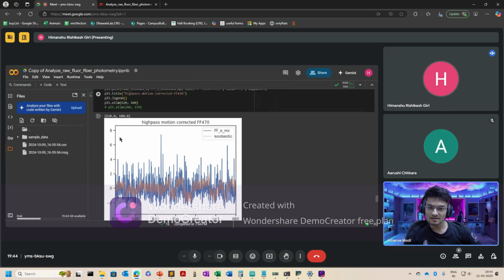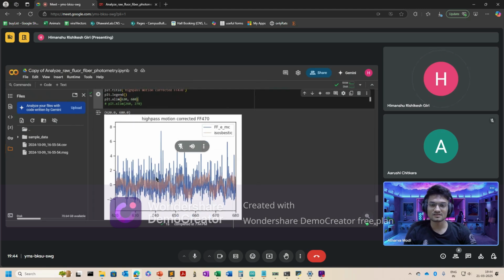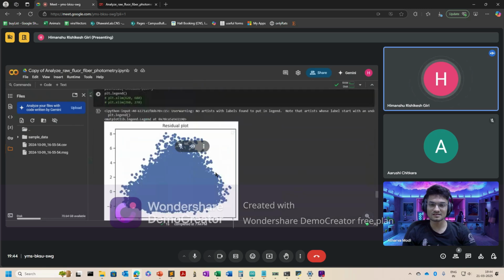Previously it was quite clear, and now it doesn't quite follow it. So this is just a check that it has worked.